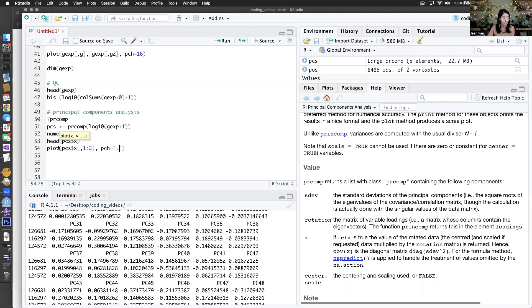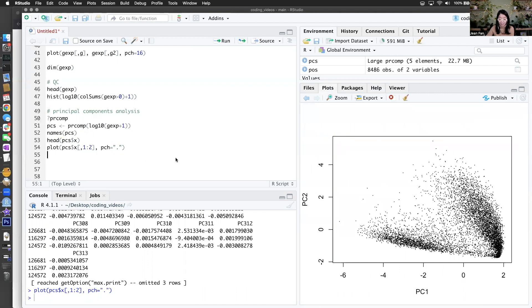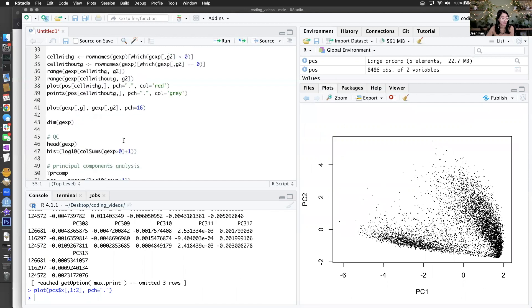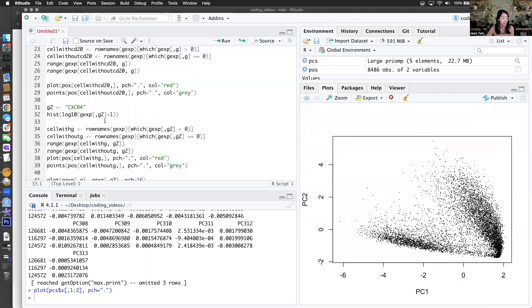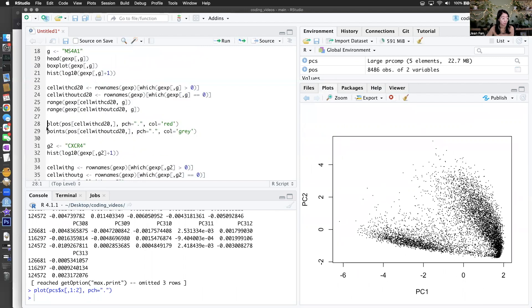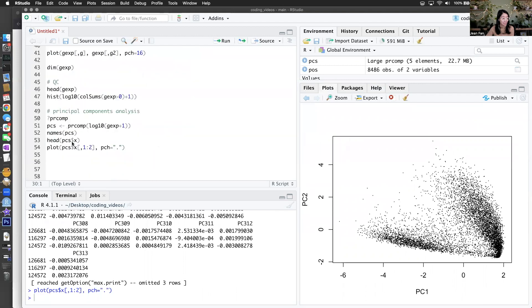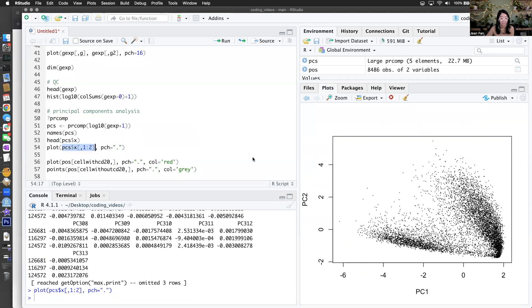Using this base R plotting — it looks like there are kind of two populations. I wonder where my B cells are. I wonder if I plotted the cells that we identified as MS4A1 positive — where are they in this PCA plot? Let's just do a quick check. Oh neat, they're all on one side mostly — kind of interesting.